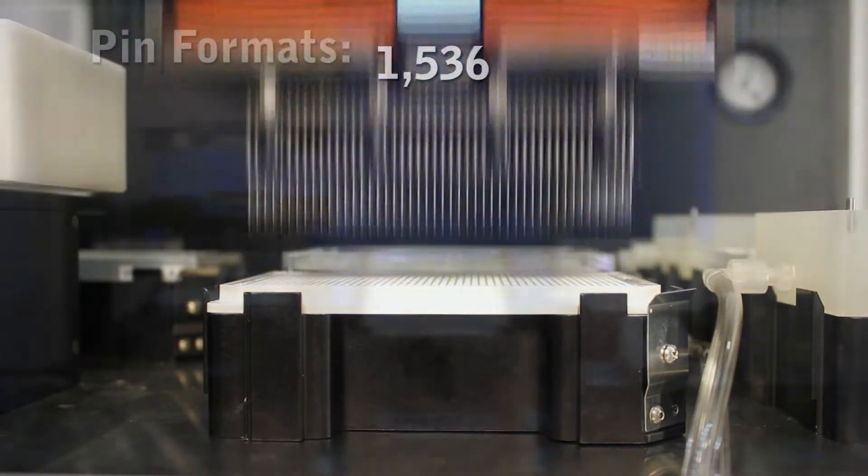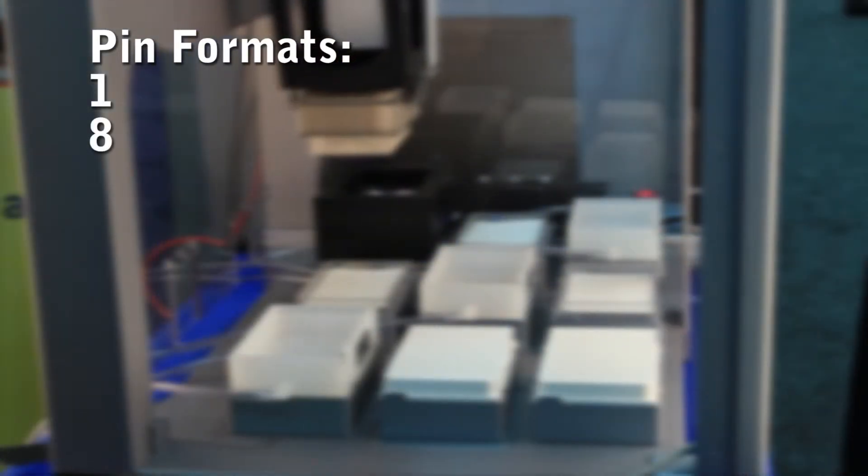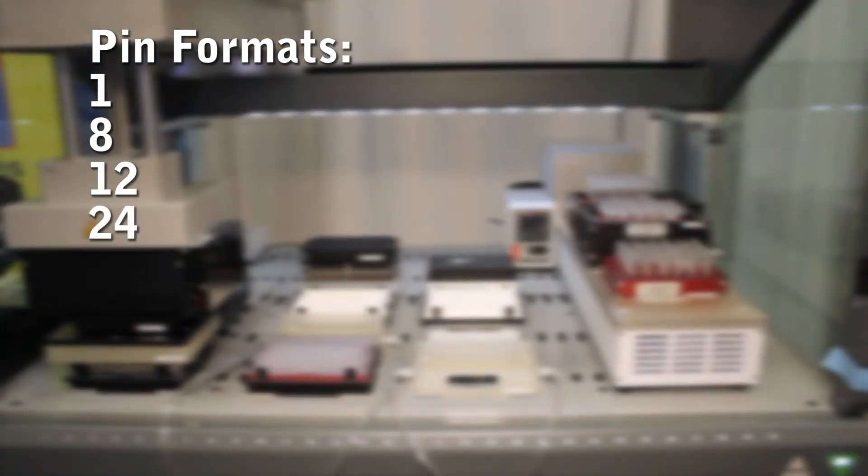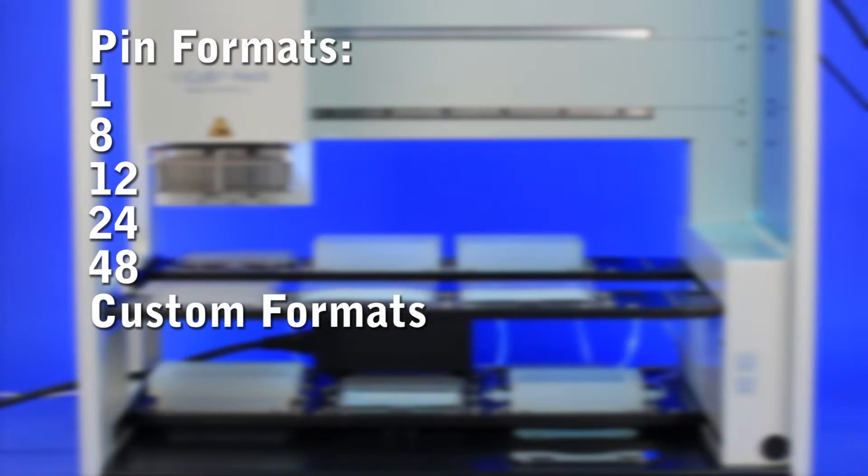We have pin tools in other formats as well, such as our single mono pin tool, 8 strip pin tools, 12 strip pin tools, 24 format, and 48 format. Custom formats can be made to meet your specifications.